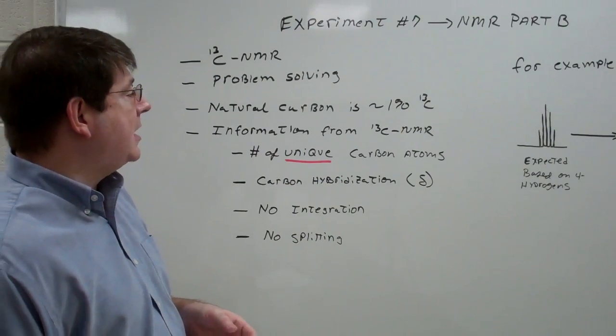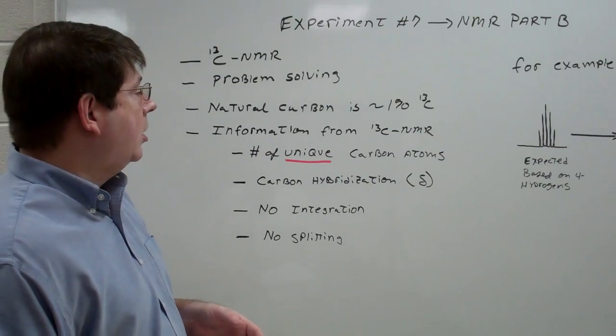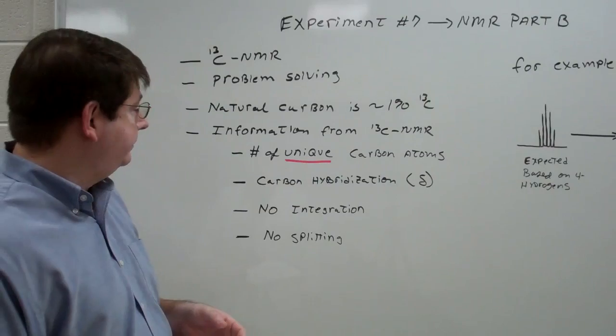So we've already run these samples for you in lab. You'll have the printouts, and again, this is a dry paper lab where you'll come in and actually learn how to interpret these spectra, not necessarily how to run them.